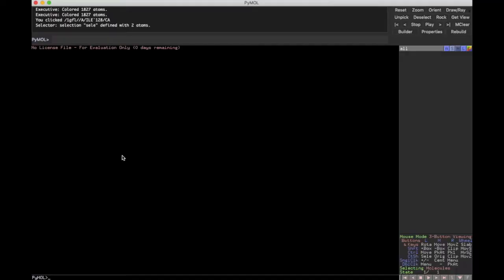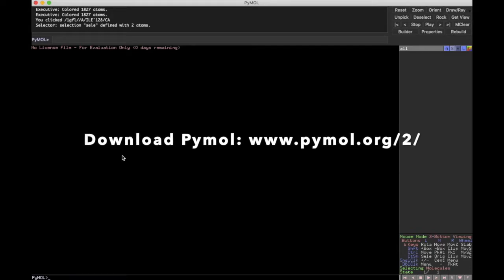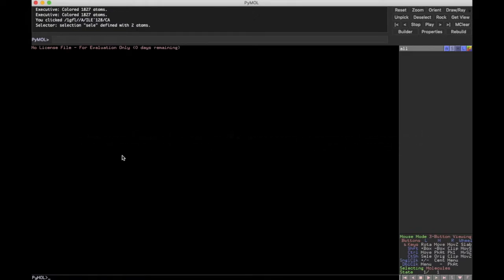Okay, so we recently downloaded a file from the PDB, or Protein Data Bank website, for green fluorescent protein. And we are now going to open up this file and learn a little bit more about this particular piece of software called PyMOL. Now, PyMOL is one of the original molecular modeling suites, and it was originally open source and developed for many, many years.